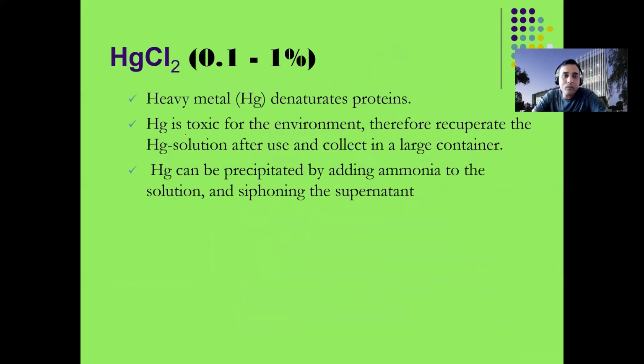There is another chemical, which is mercuric chloride. I don't like it much because it's very toxic, and people who are not very good at working in the lab can inhale it or mishandle the compound, and it can be damaging.